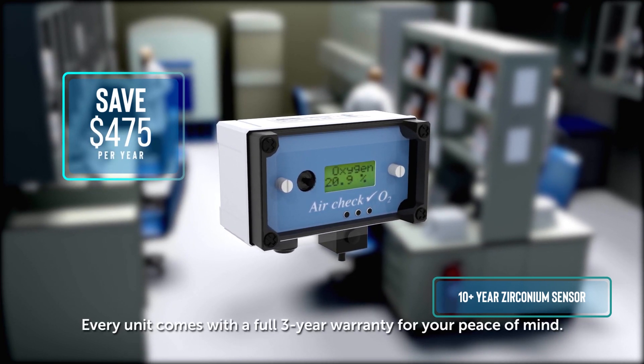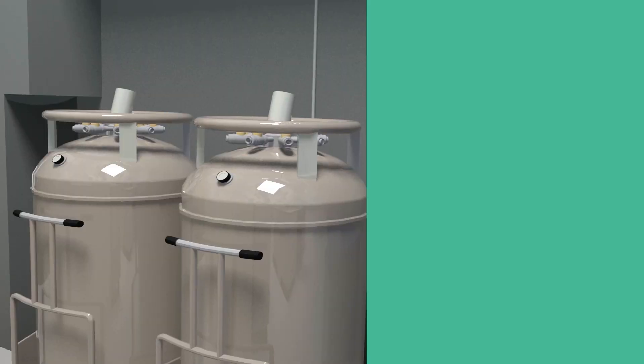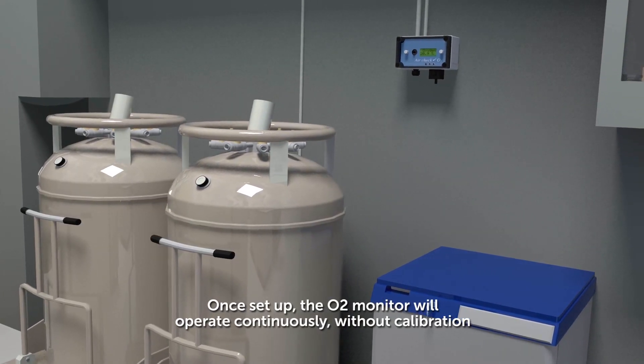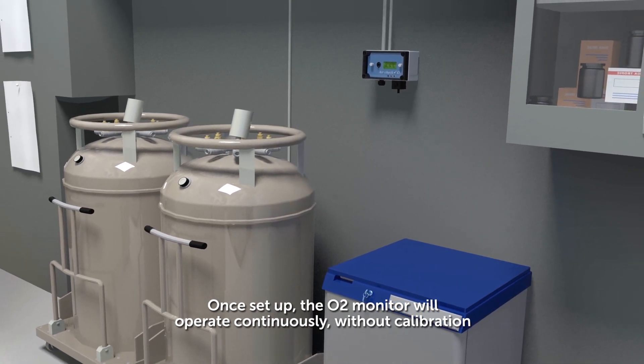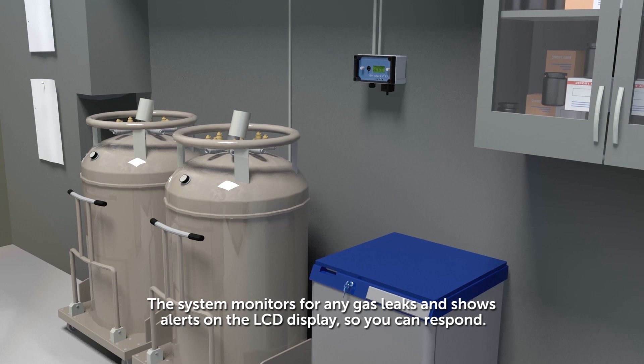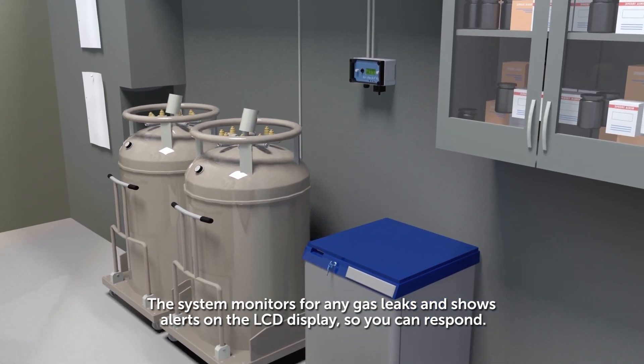Every unit comes with a full three-year warranty for your peace of mind. Once set up, the O2 monitor will operate continuously without calibration. The system monitors for any gas leaks and shows alerts on the LCD display so you can respond.